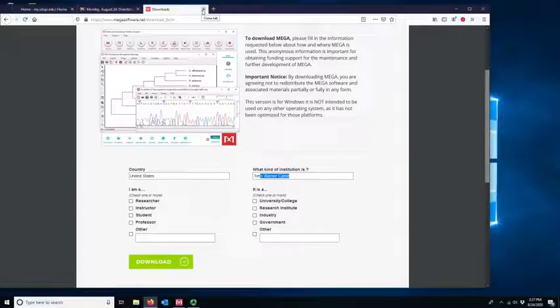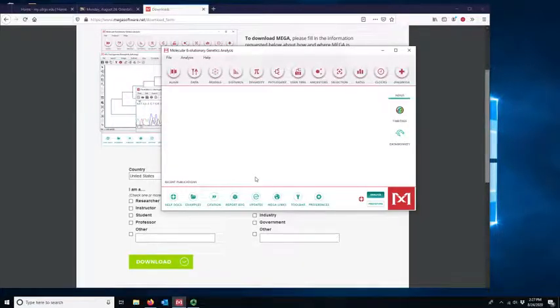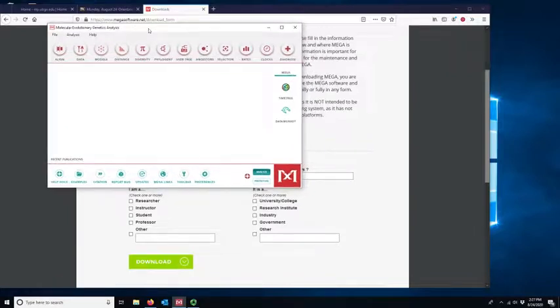Okay, so I'm going to demonstrate. I've already got it downloaded and installed. I'm going to do a quick run through and demonstration just so you can get familiar with it. I recommend that you pause the video here, download it and install it, and then follow along with me. You can put the video side by side or pause it and go back and forth. It will be helpful and help you to learn it if you are following along and doing it yourself.